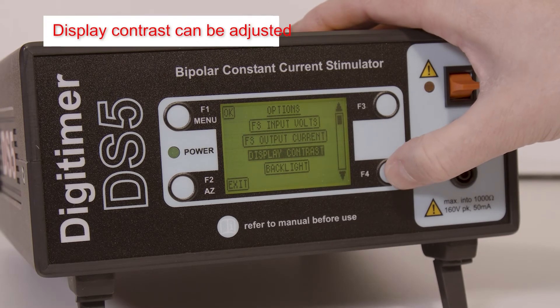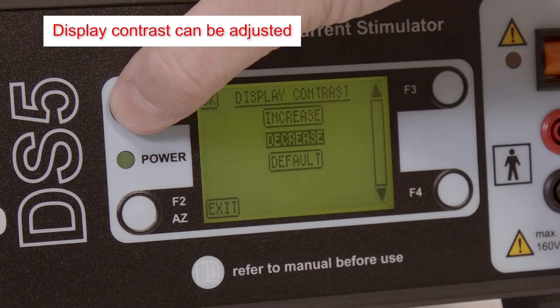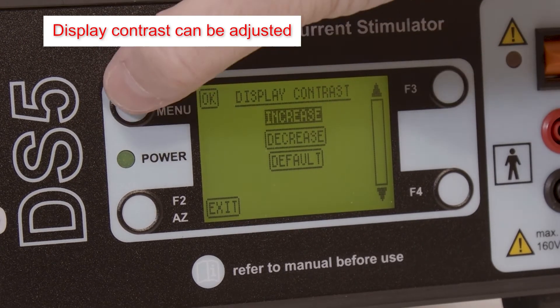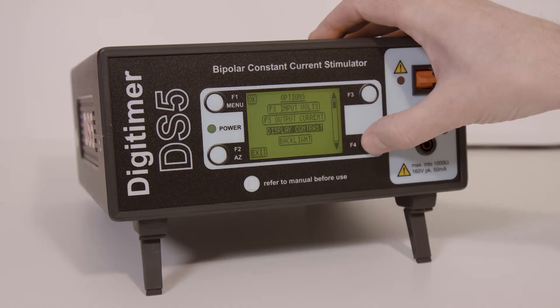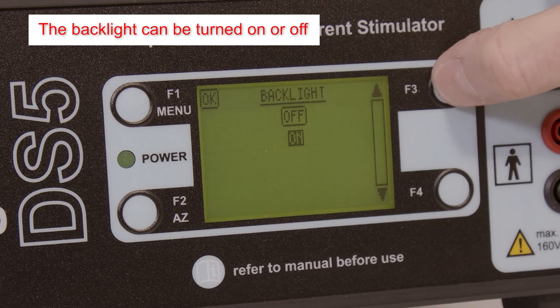Display contrast can be adjusted to suit the preference of the operator. Likewise, it is also possible to turn the display backlight on and off.